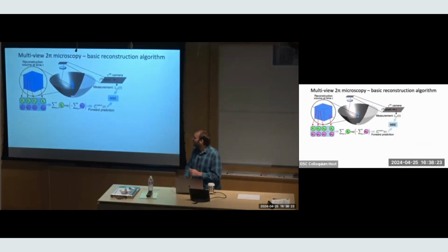And so our reconstruction algorithm for this, we have a couple actually, but one of them, for the results I'll show, essentially models each voxel. This is a fully 3D measurement technique, so we don't have this problem of occlusions anymore. In this method, we model each voxel in our 3D reconstruction as a source, F, that emits green light, but it also is going to absorb light. If there's something absorptive, the green light will be attenuated. And so we need to have both those parameters in our model.